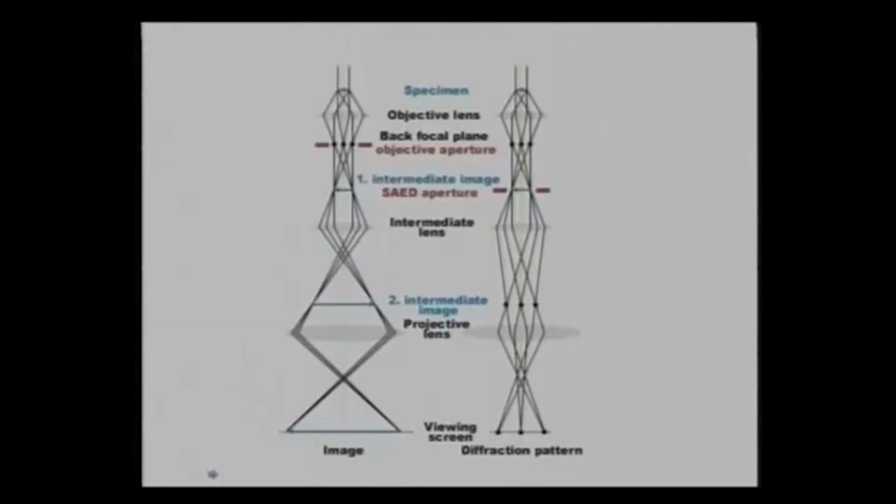and then I can measure either the amplitude or the phase, and I can tell what is happening locally in the particular material. The electron beam energy interacting with the material is generally approximately 100 to 400 keV, and for that we need a specimen approximately 10 nanometers thin. These days some other instruments are also available which can increase the energy to 1.5 MeV, and for that my sample can be as thick as 1 micron. And for high resolution imaging, I definitely need a material which is thin enough, less than a couple of nanometers.